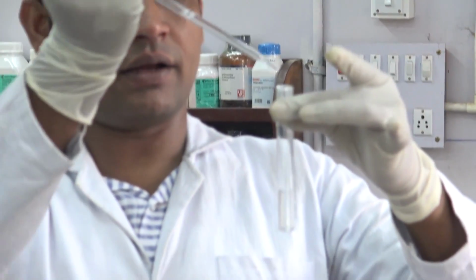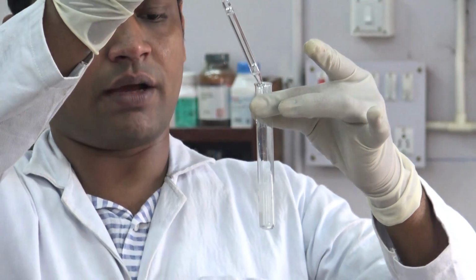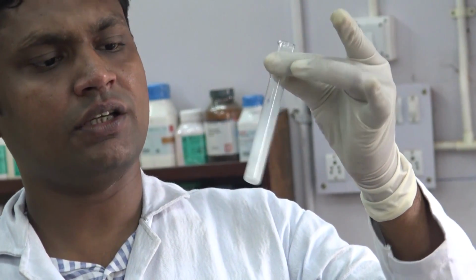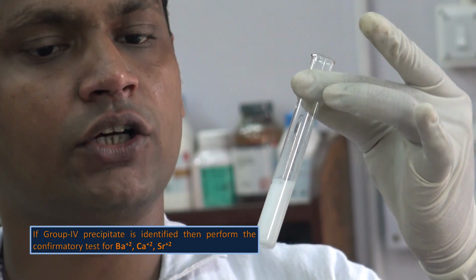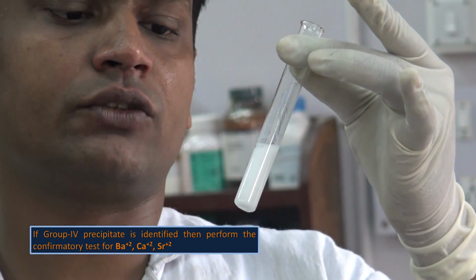Now add ammonium carbonate, that will be saturated ammonium carbonate, into the solution, and here we can see white precipitation occurs. If this type of precipitation occurs using group 4 reagent, that is ammonium chloride, ammonium hydroxide followed by saturated ammonium carbonate, then we have to perform the test for barium, calcium and strontium.